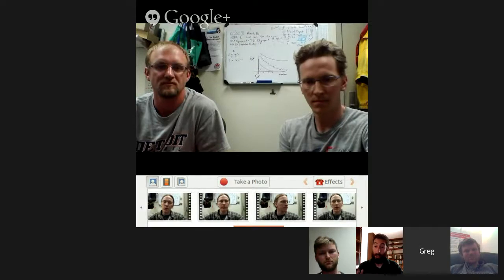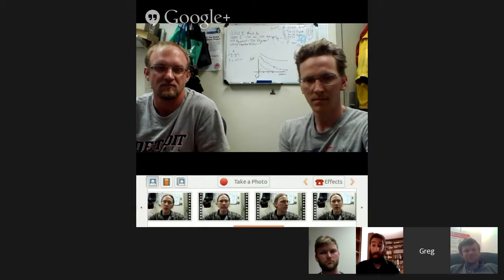Yeah, I could see, with FarmOS specifically, a Photosynq module that just uses the Photosynq data structure itself, as opposed to trying to figure out one that works for both of us, or converting to and from some standardized format, because maybe that doesn't exist yet. Just making this Photosynq-specific module would give you another place to send the data, so you can do both and use them for different purposes. Maybe one for analysis, one for organization, something like that.